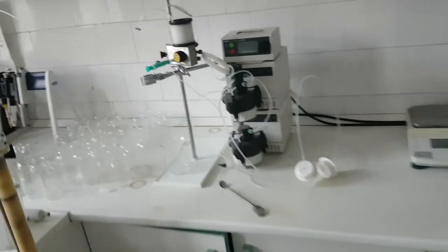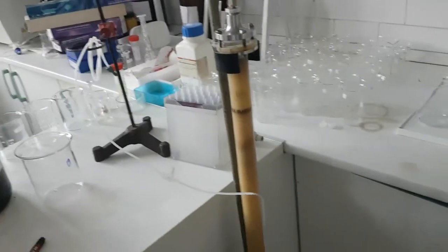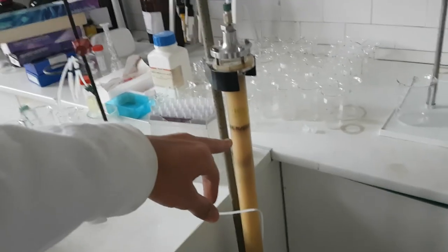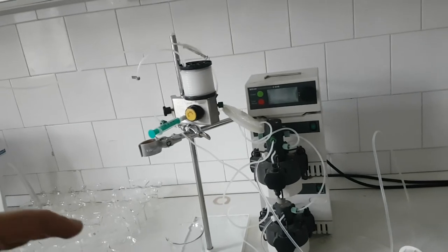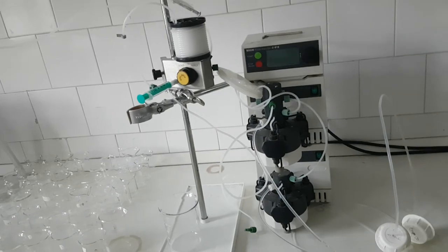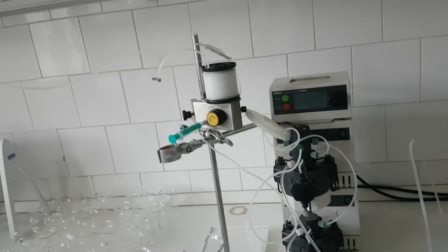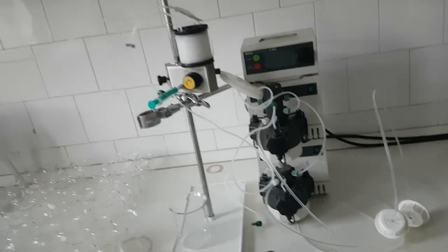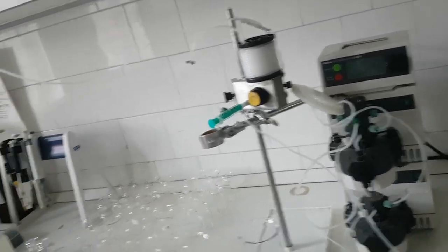This here is a medium pressure apparatus. We have a column — when you prepare your extracts, you put them here and apply some pressure. We call this a medium pressure apparatus and you can achieve some separation, but there is no detector here. If there were a detector, it would be better.